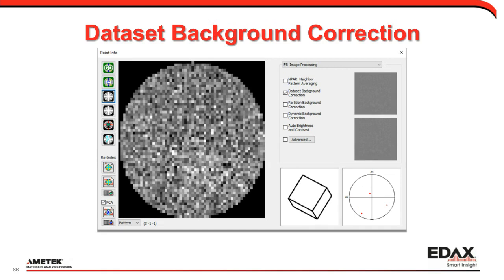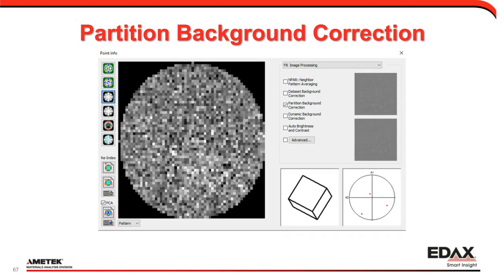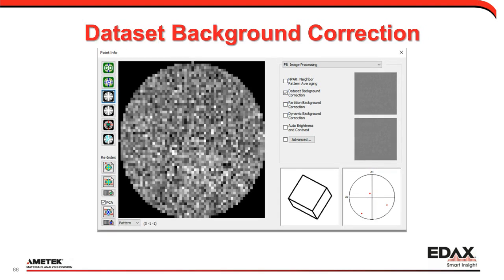Oh, oops, actually, let me go back real quick. This is the data set background correction. Now, this is something I should probably touch on. Here I can see I have both what's called a data set background correction and a partition background correction. And they are different things.